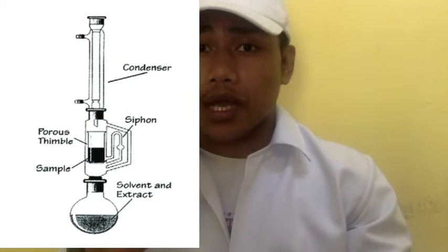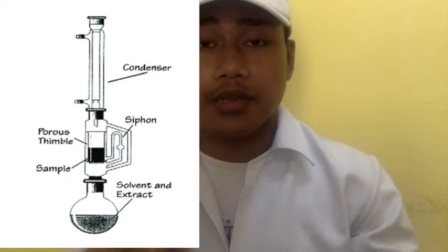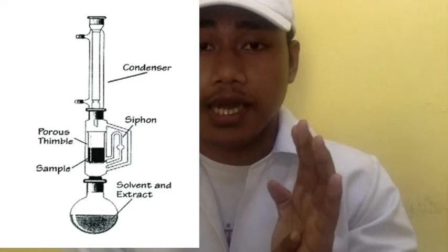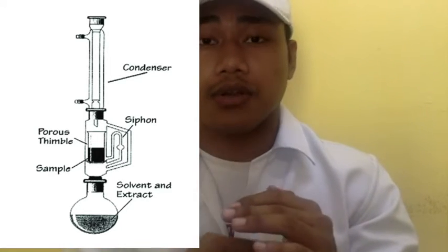in the hot solvent. When we talk about a method, there must be a lot of apparatus involved. So the Soxhlet extraction has a Soxhlet extractor that consists of three main components. What are the three main components? The first one is the percolator that consists of the boiler and the reflux that circulates the solvent.